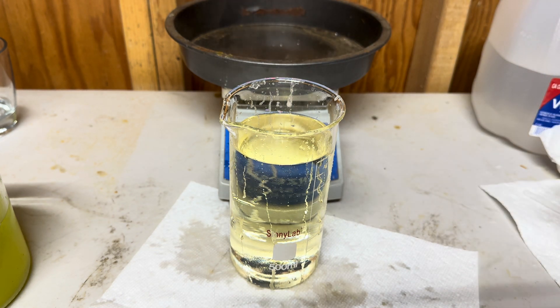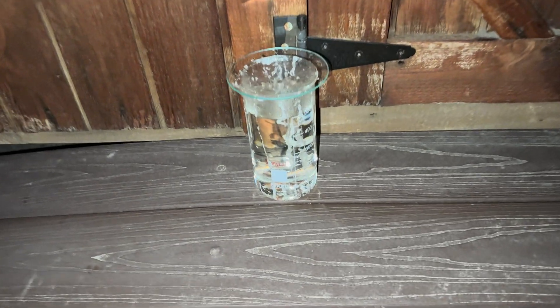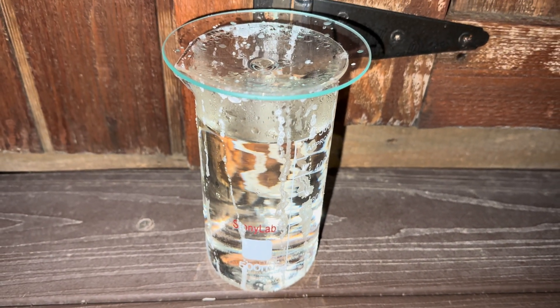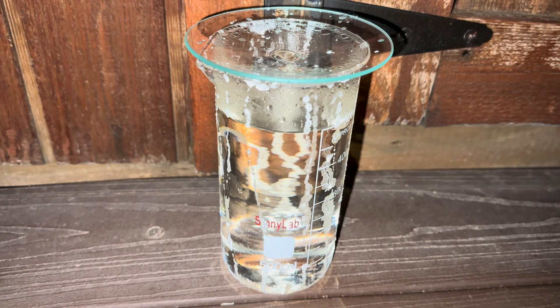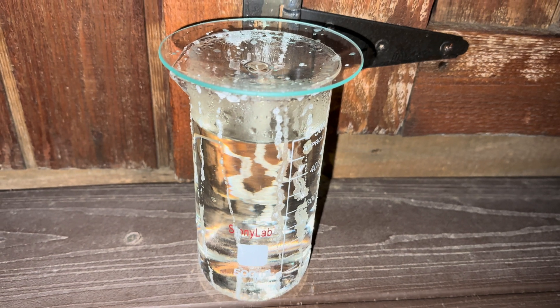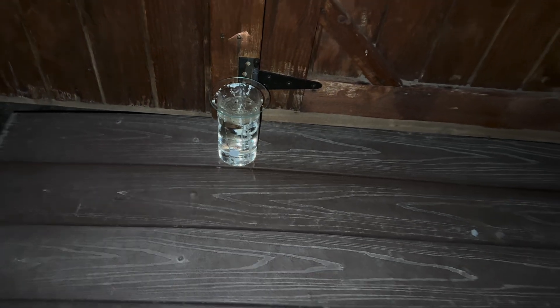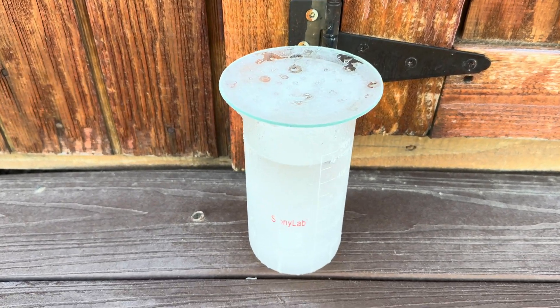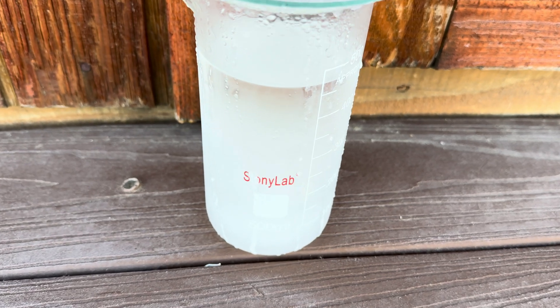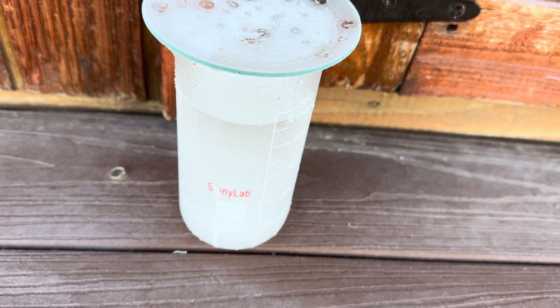When this solution reaches 32 degrees Fahrenheit, all of what is now potassium sulfate will settle out and we will have HNO3 — nitric acid. This step needs to reach 32 degrees Fahrenheit and remain at that temperature for four to five hours. Since tonight's temperature is forecast to reach 27 degrees Fahrenheit, I'm going to leave this solution outside overnight and we'll get back to it in the morning.